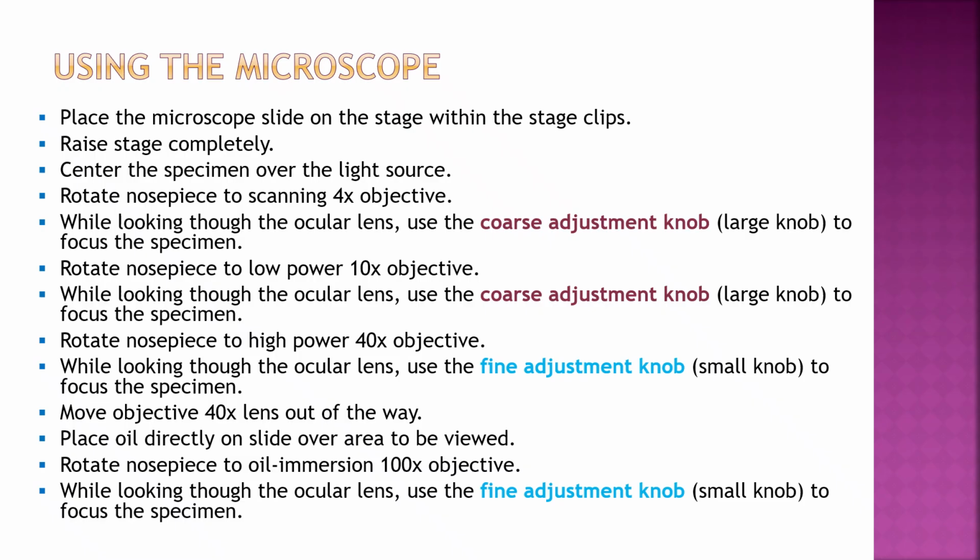You always leave the microscope with the stage completely down. So when you're finished with your microscope, you leave it down, so the next person that's going to come along is going to slide their slide in and then raise it straight up. Then you're going to center the specimen over the light source. You're going to turn your light on, obviously.